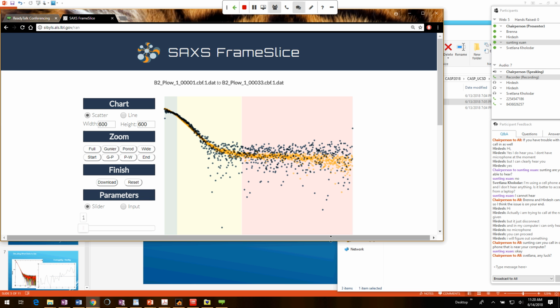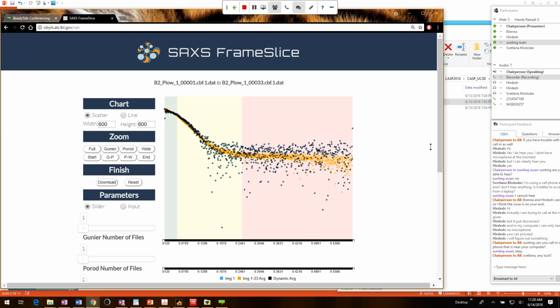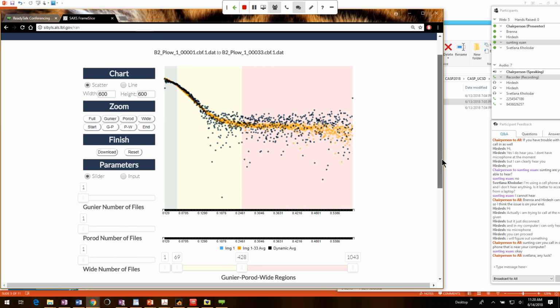The tool allows you to zoom in on the different regions. And what we're looking at right now, what is appearing should be a dark-ish black curve, which is only the very, very first exposure, only the very first 0.3 second exposure. The orange one in the background, that's using all data sets, all averaged together. The extent to which they disagree with one another is indicative of how much radiation damage it's received over that exposure. So to the extent that the orange line doesn't fit within the noise of that first exposure, that's radiation damage, and that's what we're going to correct for right now.